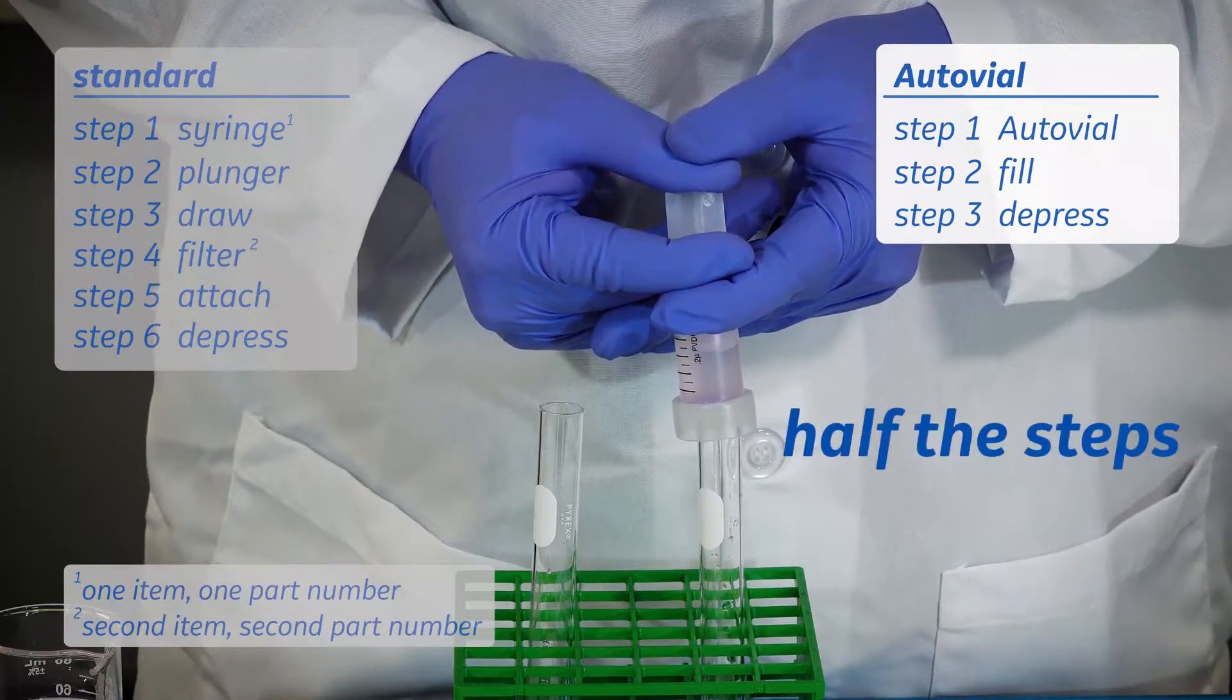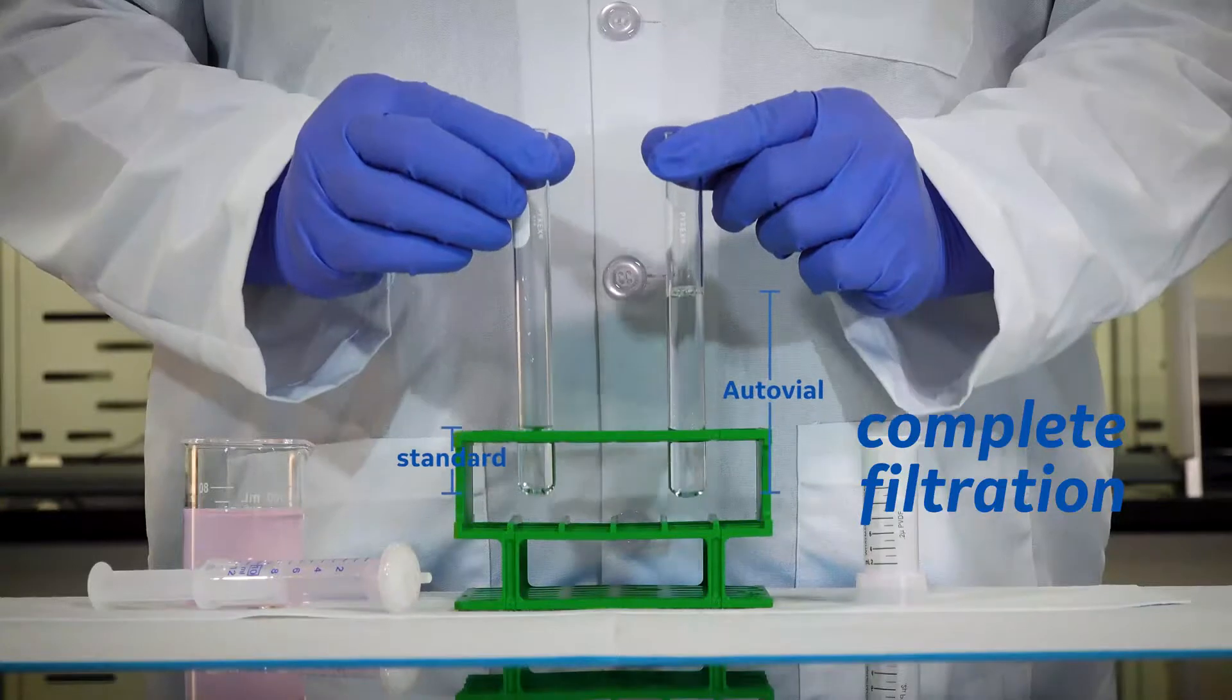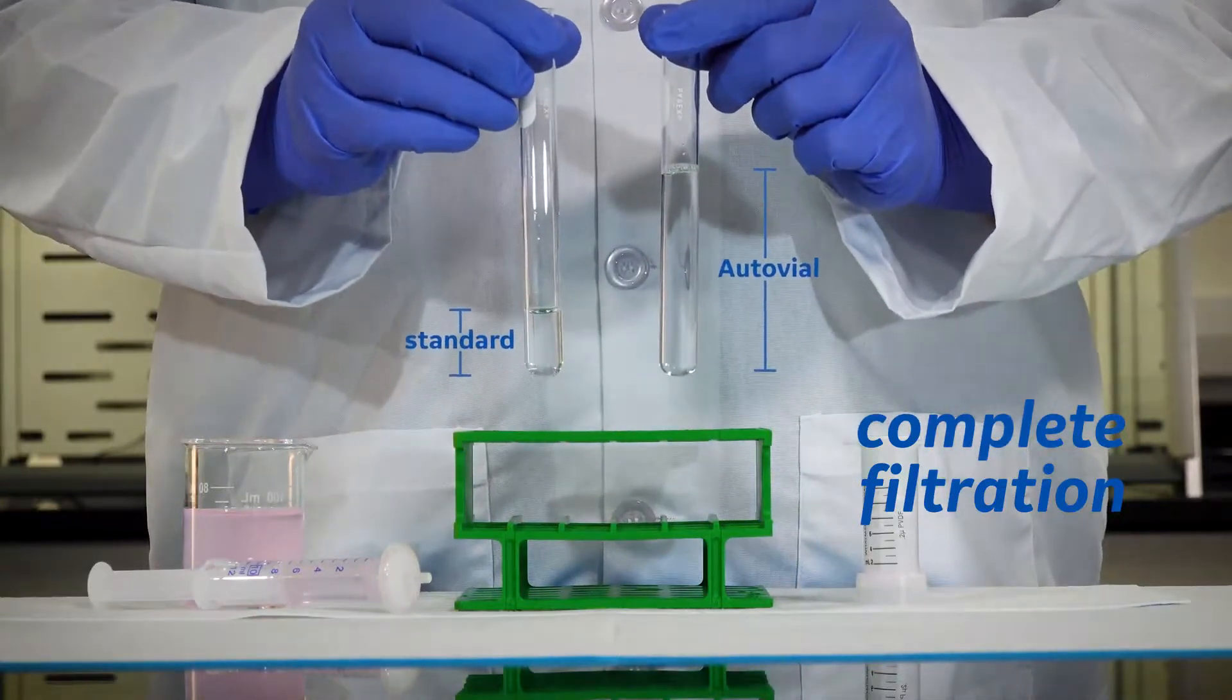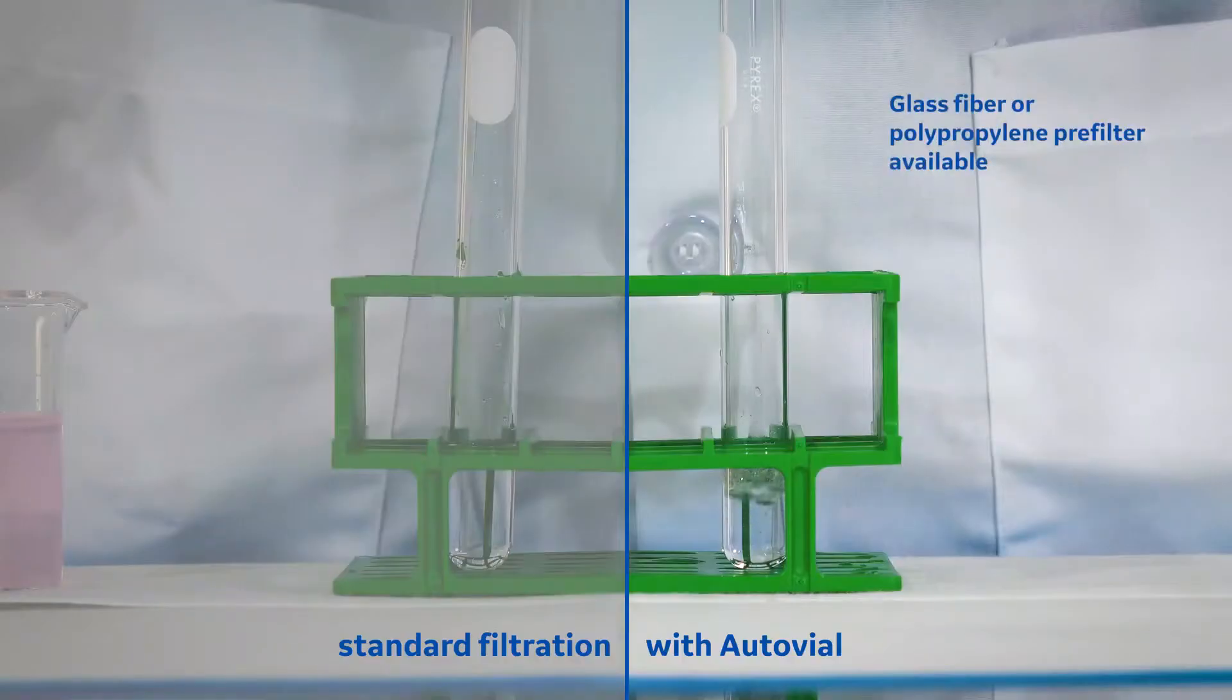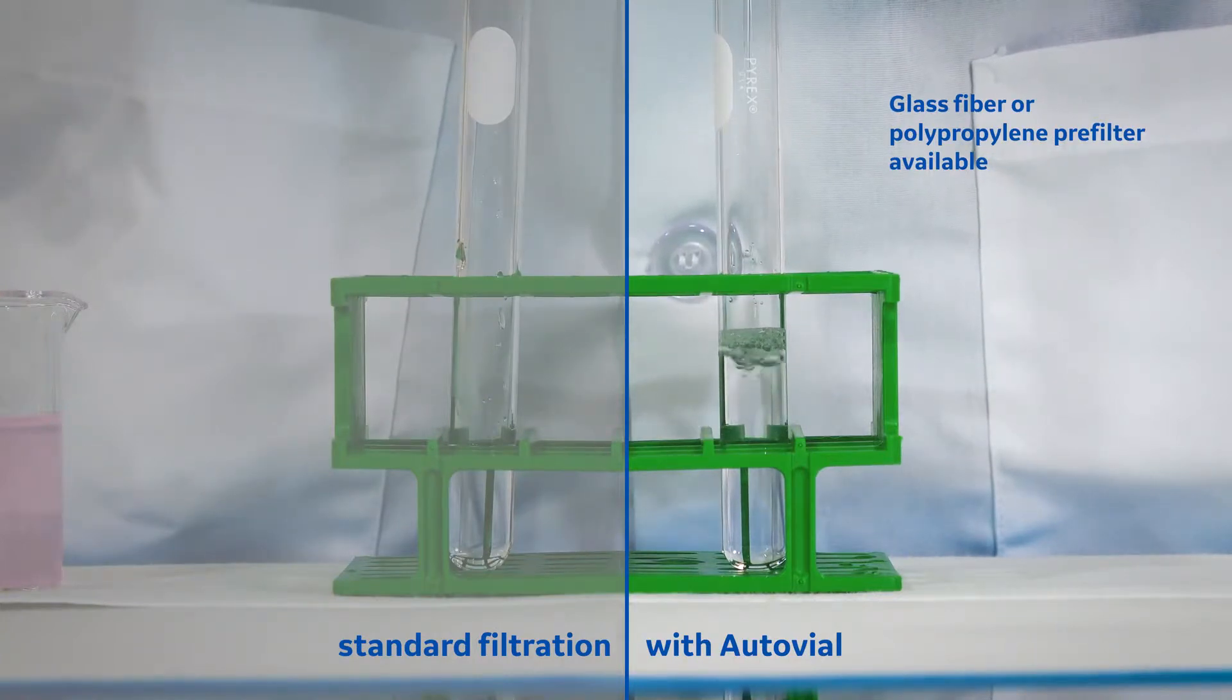Half the steps, a single unit. And did you notice that all the sample was easily filtered through the autovial? This can be achieved using the built-in glass fiber or polypropylene pre-filter available in selected models.